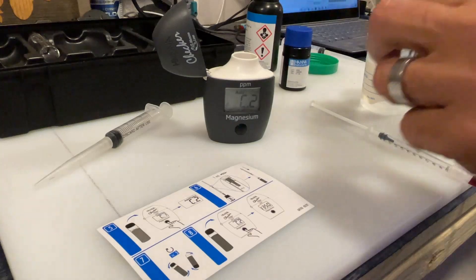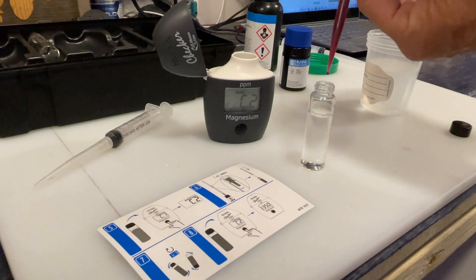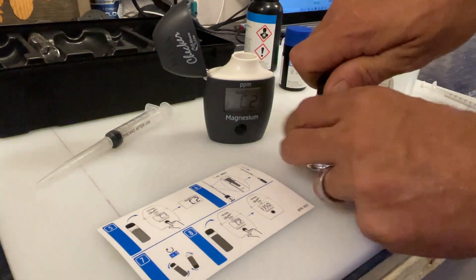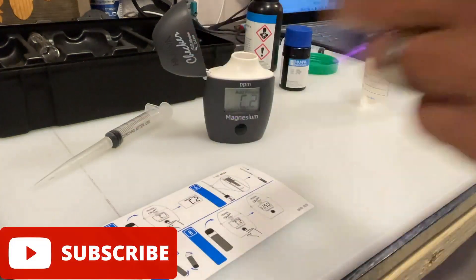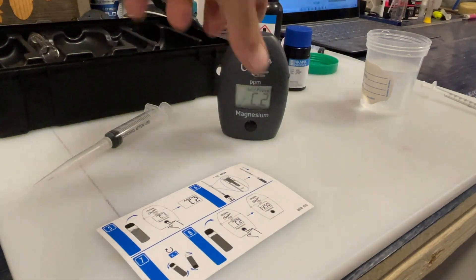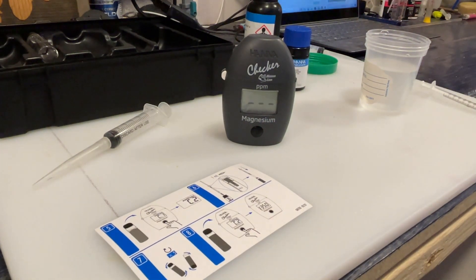Open up the checker, pull out the cuvette, take off the cap, and place that 1 ml straight into the cuvette. Place the cap on, invert it five more times, make sure the cuvette is clean with no fingerprints, place it inside the Hannah checker, close the lid, press the button, and we have our magnesium reading of 1200 ppm.